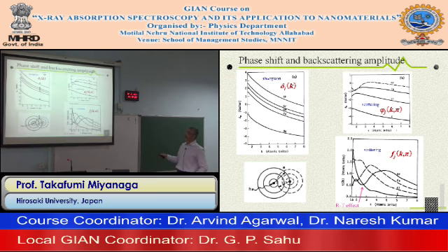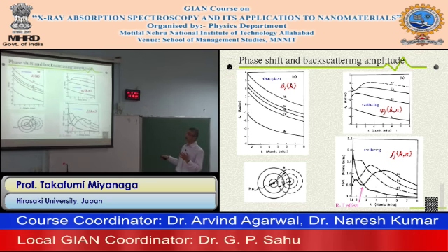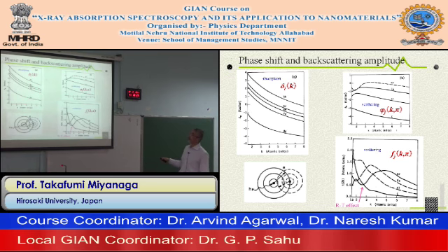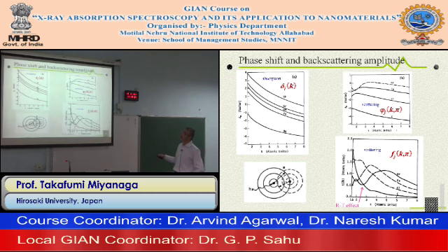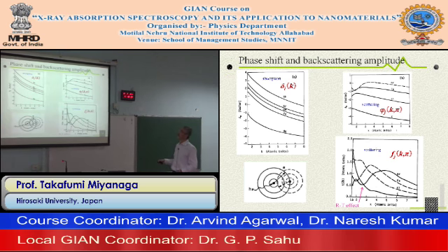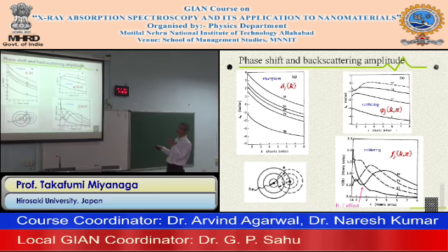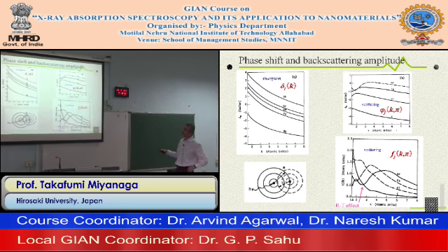The central atomic absorption phase shift from the absorbing atoms is different between these metals, magnesium and rhodium, but the function is very simple. On the other hand, this is the phase shift of the scattering atoms: carbon, chromium, and bromine here. It is somewhat complicated in comparison to the absorbing case.